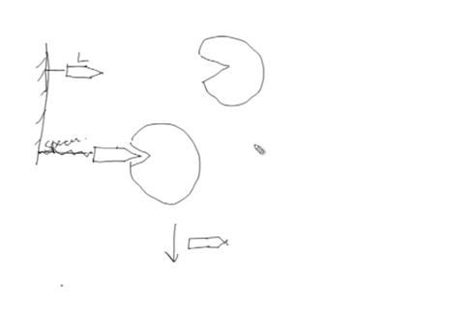Now, when you have a free ligand in higher concentration, what will happen? This free ligand in higher concentration will replace the bound ligand on the column. So, you will get an elution pattern where the free ligand has replaced the bound ligand, and this whole thing could then be passed out as an eluate from the column.